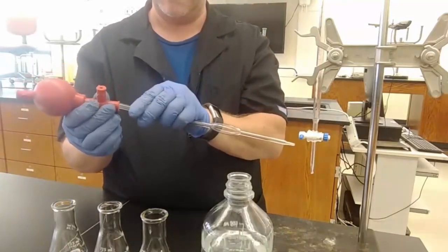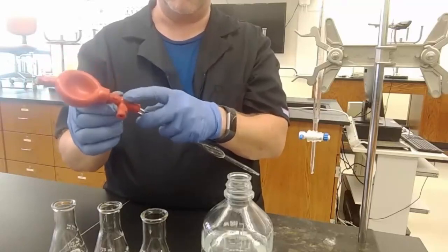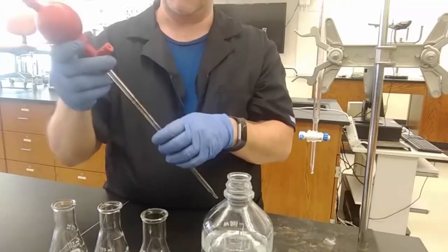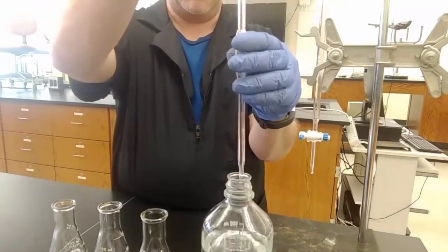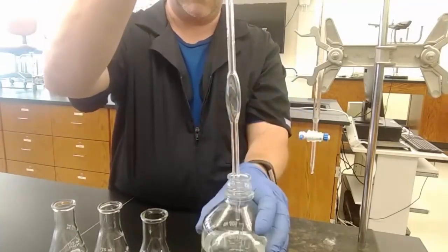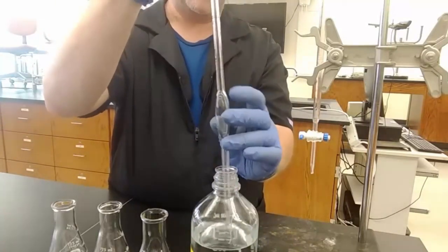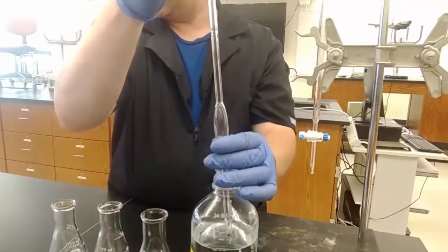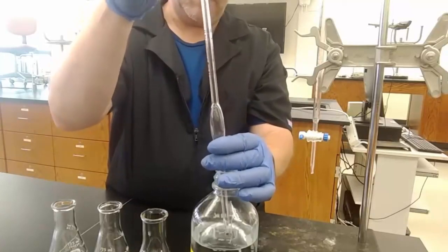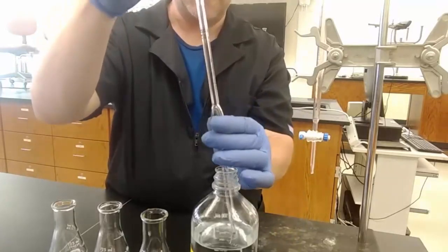So you want to put this on gently, because if you shove it in there, you'll blow the valve to pieces. There's a little ball bearing in there. And we know that our pipette is clean, and so that's the only reason that we can go directly into our stock solution bottle. We would not want to contaminate this bottle. So the reason that it says pour around 30 milliliters of acid into a 100 milliliter beaker is that we don't want this bottle contaminated. I am not contaminating it. I know that my pipette is clean.